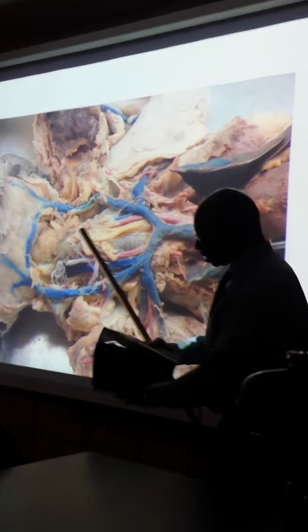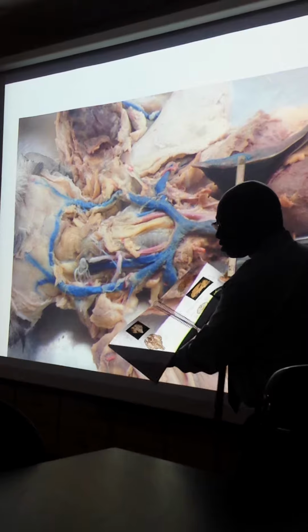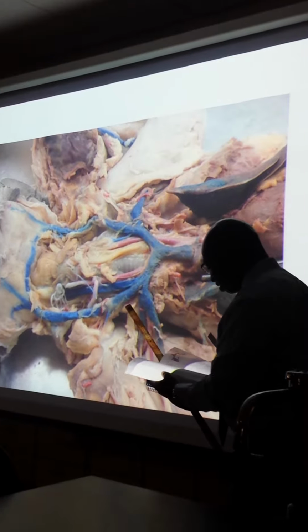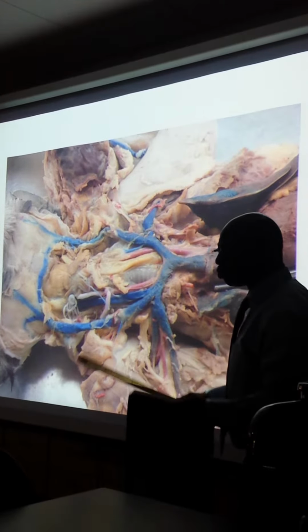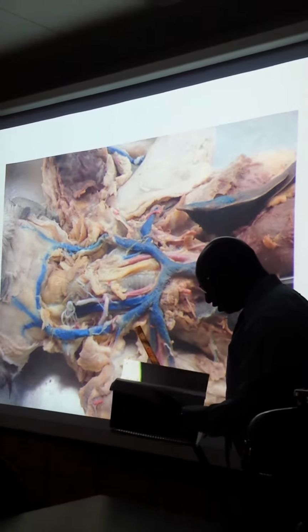It's very good. Use it for the 300-some pages, and it will have diagrams of the actual cat so that you can help estimate the location of some veins, and then look for them in your actual cat, especially as we go towards the final.